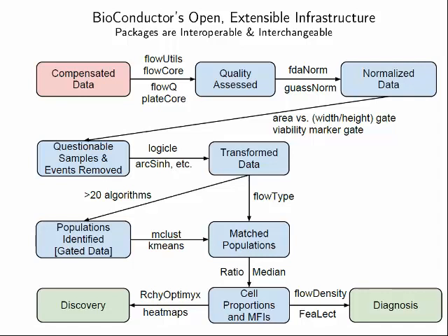Fantastic. So a few tools. Before you even start doing any kind of analysis, you want to make sure that it's not crap. And it's very difficult, and I'll talk about this later, to figure out what's crap and what's not, because there are no statistical p-values to tell you that. So what you have to do is visualize your data. We have some different ways to help you visualize your data to see if things are going wrong. We can't tell you what's going wrong, or even if something is actually going wrong, but we can play the game of one of these things is not like the other. It's really important to do.